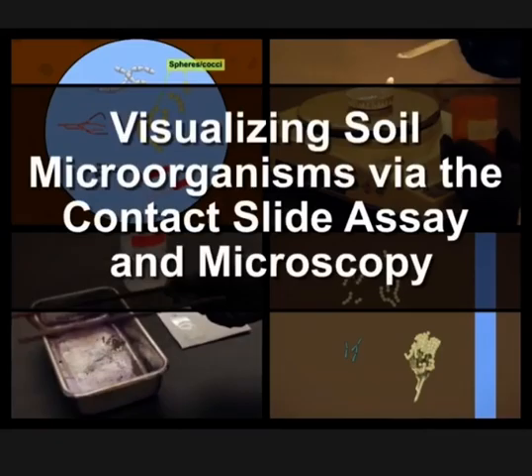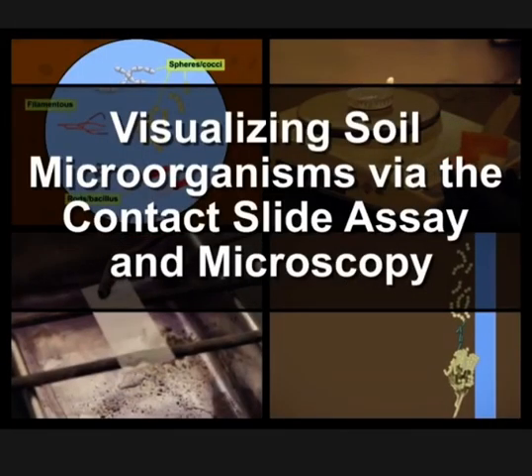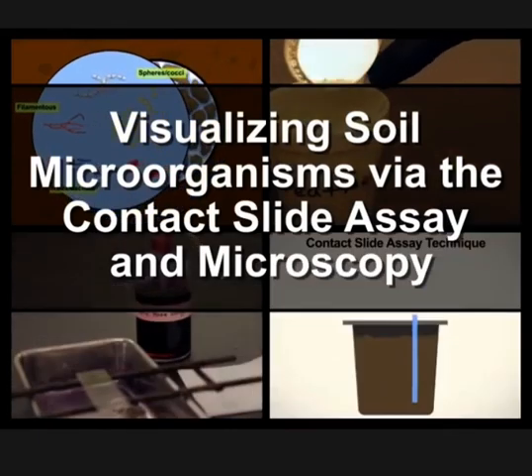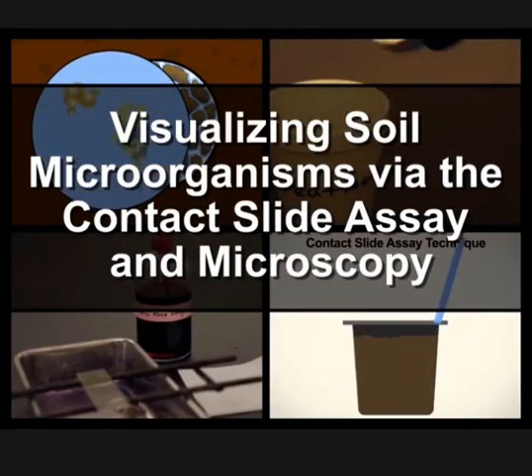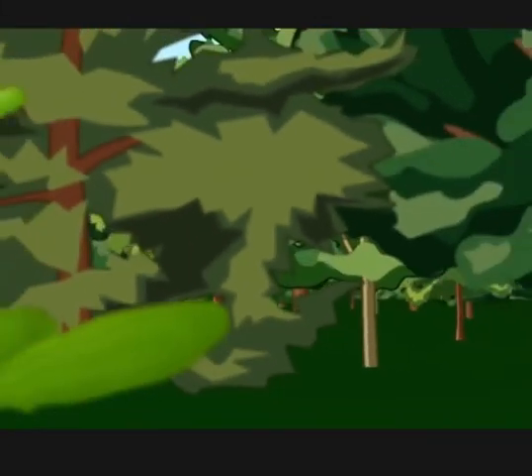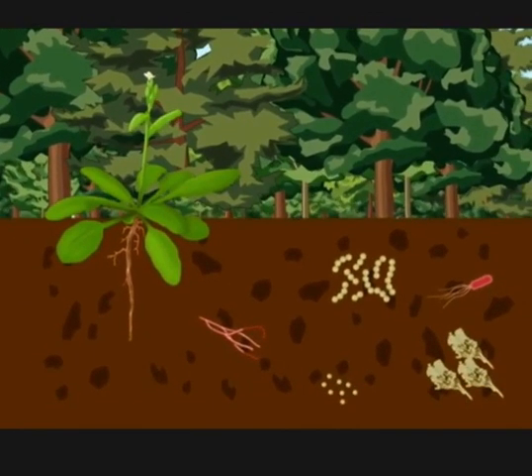The relationships between the various organisms and inorganic components in soil are vital to understanding soil changes and environmental stresses, but cannot be elucidated without direct visualization. Soil, an extremely complex system, is a habitat for millions of diverse organisms.